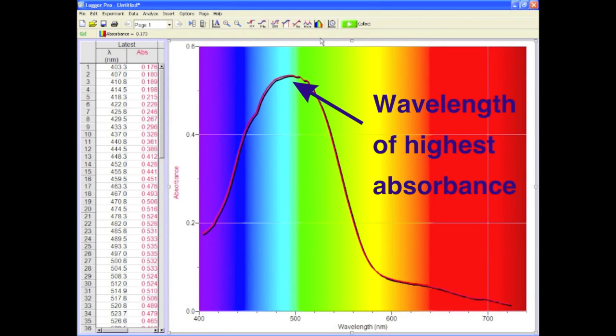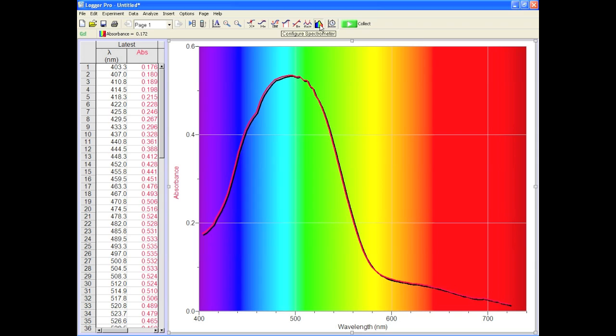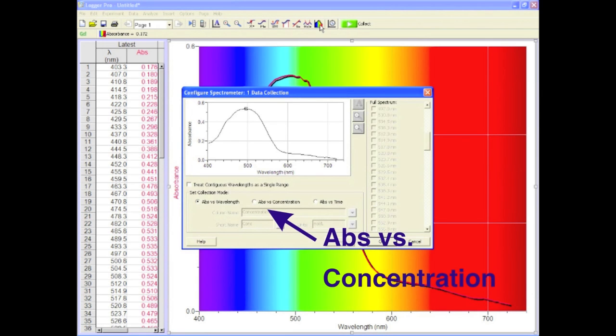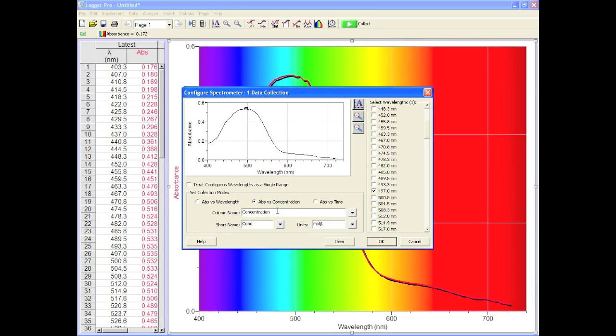Now, you want to choose the wavelength of highest absorbance, which is shown by the arrow. Press the Configure Spectrophotometer button, find and click on absorbance versus concentration and choose the best wavelength on the right. 407 nanometers looks good in this case. You should also fill in the boxes with the correct concentration units and stuff so your graph looks right. Done.